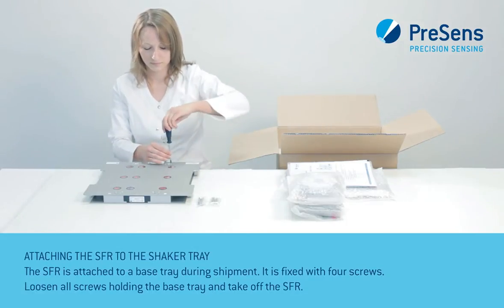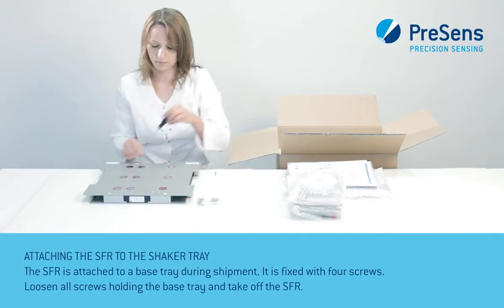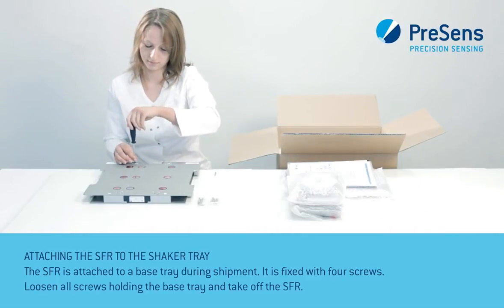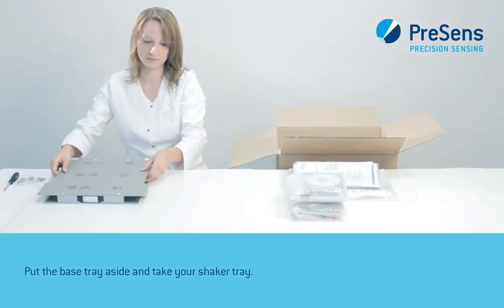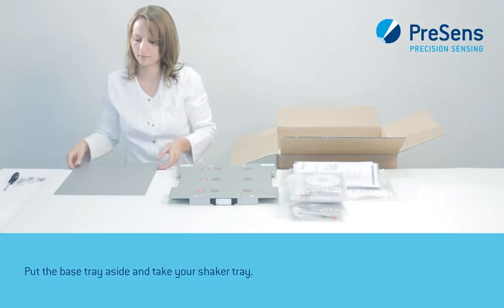The SFR is attached to a base tray during shipment. It is fixed with four screws. Loosen all screws holding the base tray and take off the SFR. Put the base tray aside and take your shaker tray.